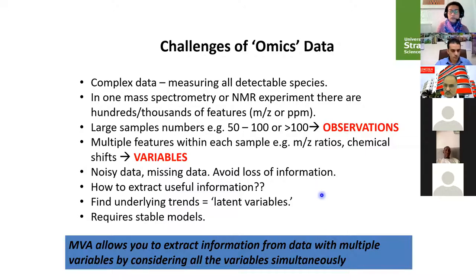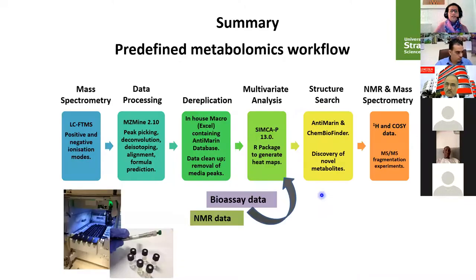So what we're going to do for the rest of my seminar is I'm going to show you different cases, how we apply multivariate analysis to be able to make decisions in isolation of the bioactive metabolite. So this is our predefined metabolomics workflow. We usually start with mass spectrometry.